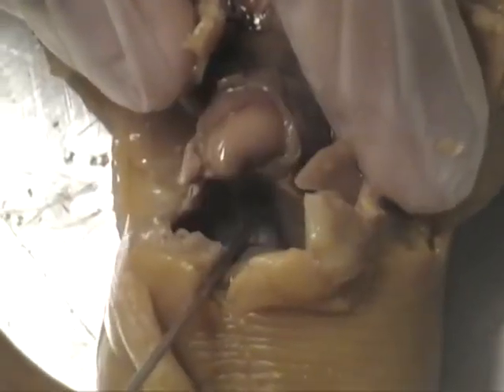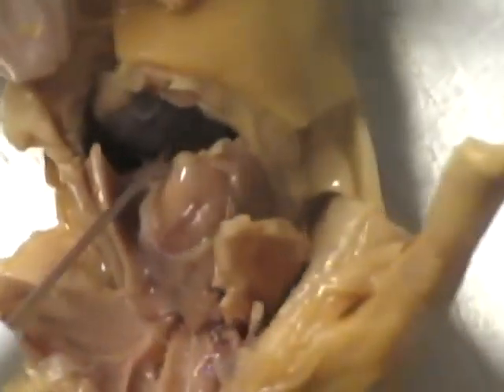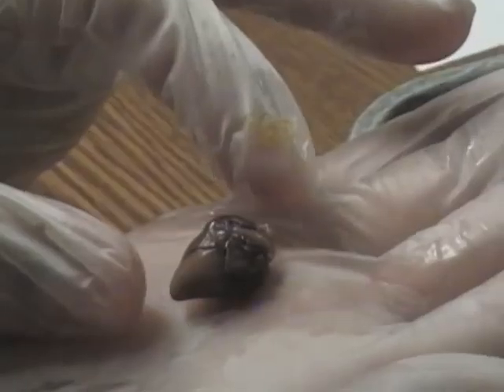Okay, so right there is the post-cava. And so you can see it better. Right in there is what I think is the diaphragm. Here's the heart. Kind of forget which side is which.